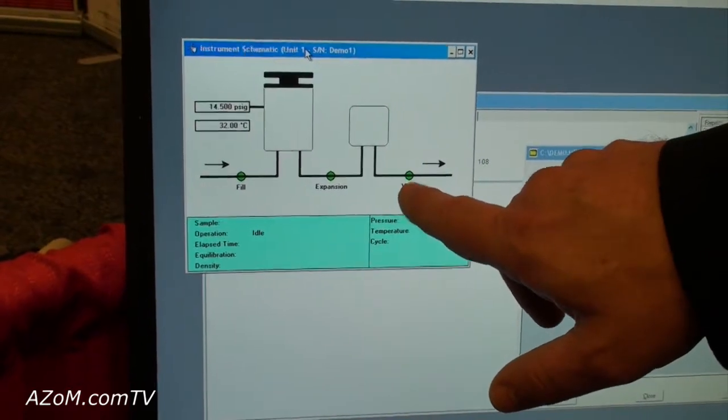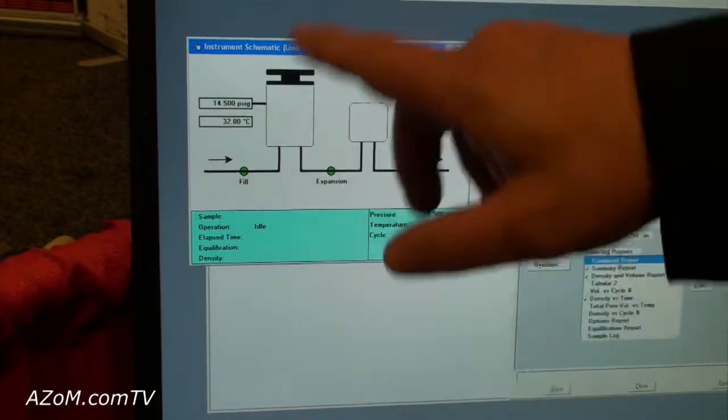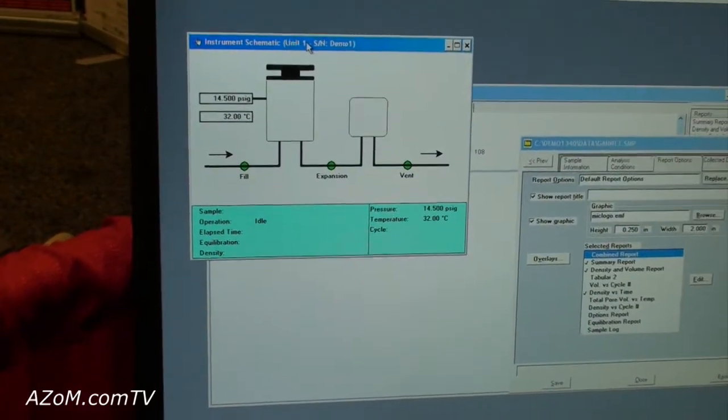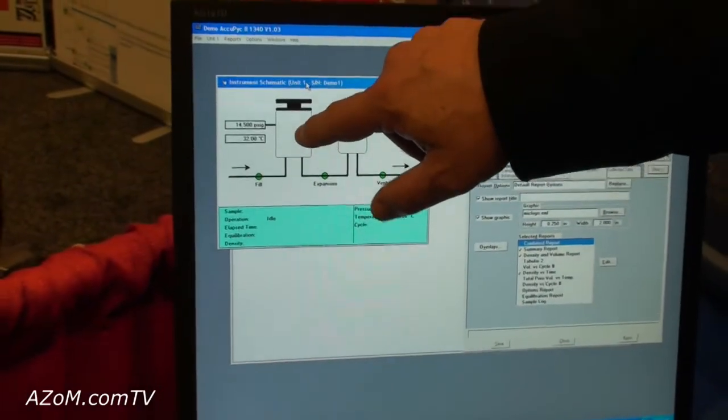And then we permit the gas to expel through an exhaust valve. This cycle gives us the ability to look at, using the ideal gas law, the volume of gas displaced by a sample in the sample chamber.